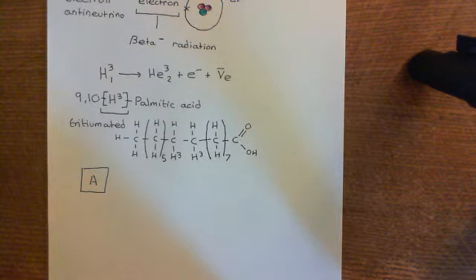Even though the cells will probably have a gene, in fact they'll probably have 2 genes for protein A already, we want protein A hugely overexpressed, and the best way of doing this is to add in a new gene, an extra copy of the gene, okay, by putting it on a plasmid, for instance, and transfecting the plasmid into your cell line. Okay, so I'm going to start off with a discussion of some decent cell lines that you could use to do this experiment in.